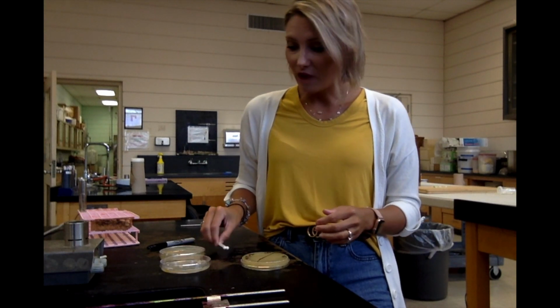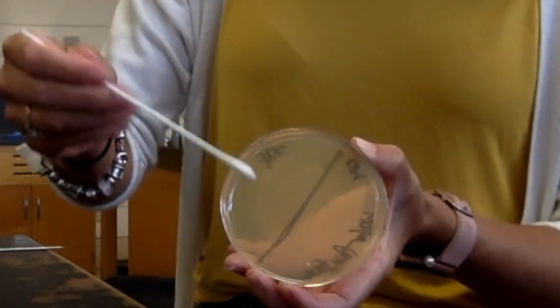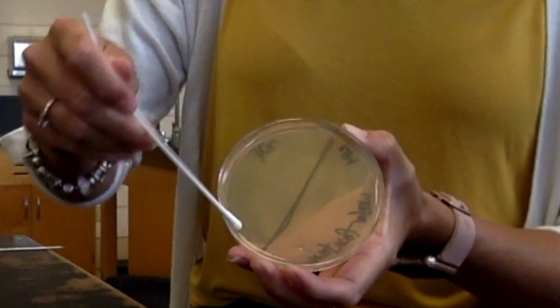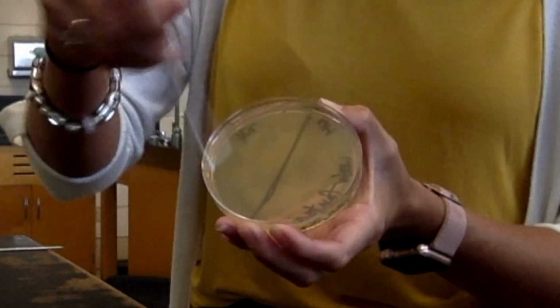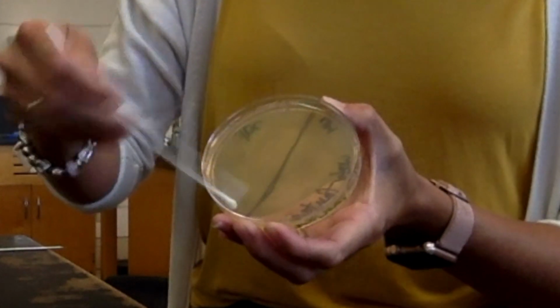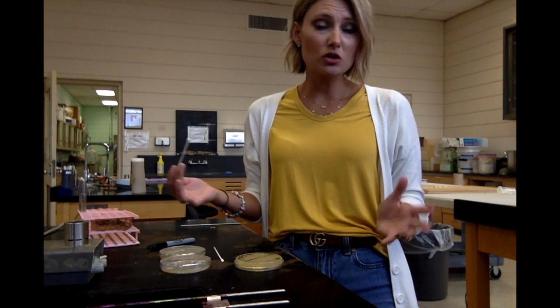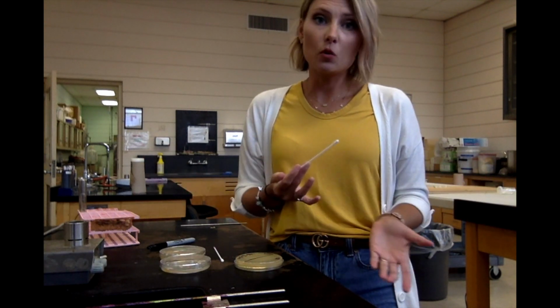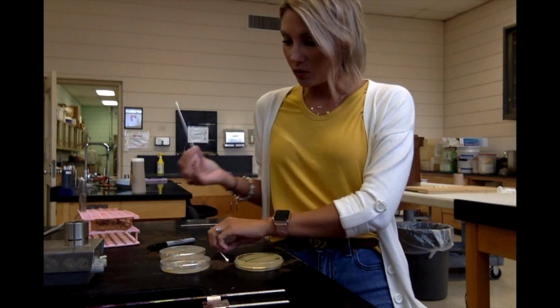And so basically if I went and swabbed a place, then I would simply take my swab and go back and forth on the plate. Now you want to swab a good bit, because of course we want to see bacterial growth. So you want to swab really well. And then of course when I'm done with my swabs, they go in the biohazard, because we don't know what kind of bacteria are there. So we want to make sure that these get thrown into the biohazard when you're finished.